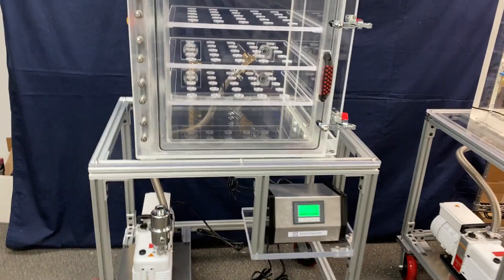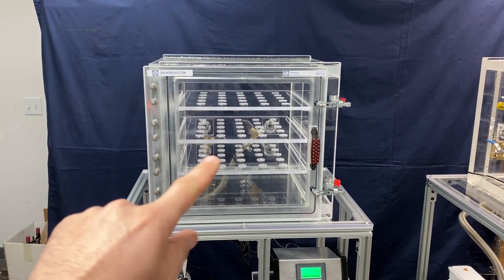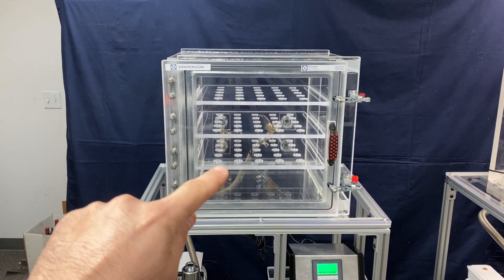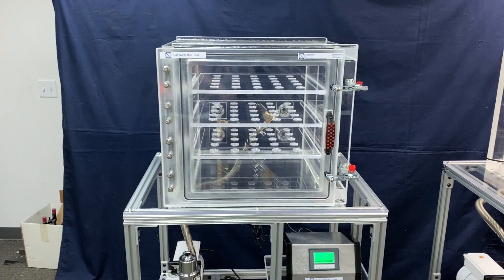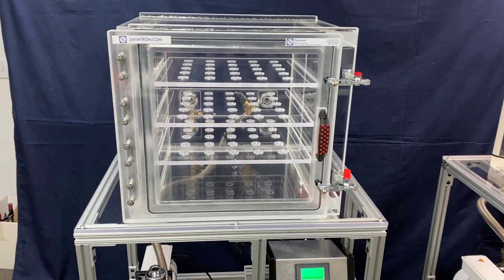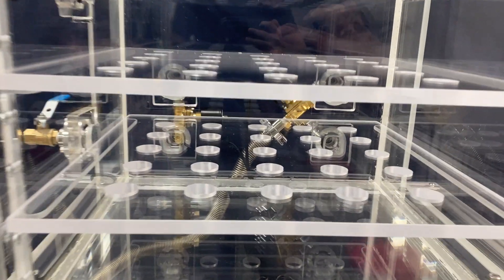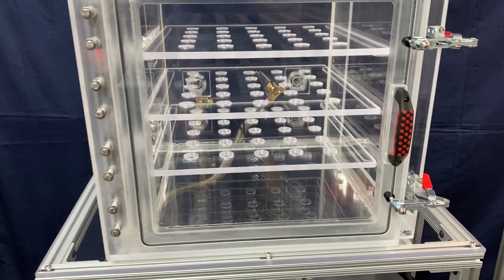The system consists of an acrylic vacuum chamber. It has three perforated shelves. These shelves are fully removable and they're perforated to allow for easier airflow to go through the holes. In the back of the chamber you can see the vacuum and venting valve.